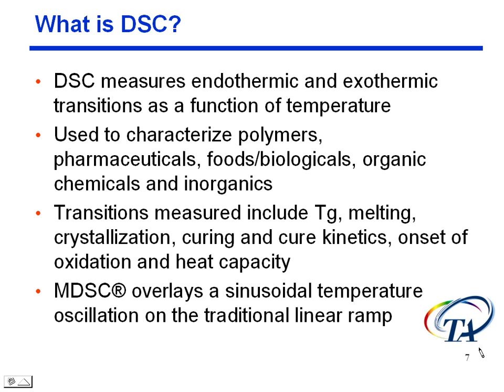Now, just what is DSC? Just as a quick review, and to lead us into modulated DSC: DSC measures endothermic and exothermic transitions as a function of temperature. DSC is used on a wide variety of materials, polymers and pharmaceuticals probably being the most common, but also in the food and biological industry, organic chemicals and inorganics.